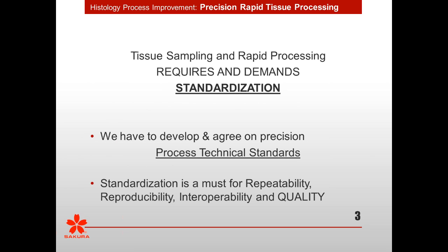We all have good standardization of our processes from lab to lab, but we're not so good at having that standardization across the whole industry. And I think as we continue to move forward with personalized medicine, as new and multiple molecular techniques continue to be pulled back into histology, standardization is going to be key for us. We have to develop and agree on process technical standards.